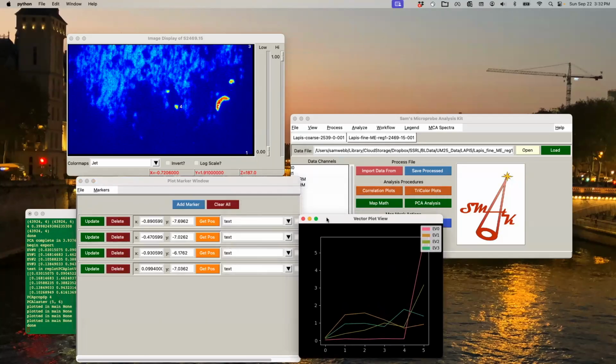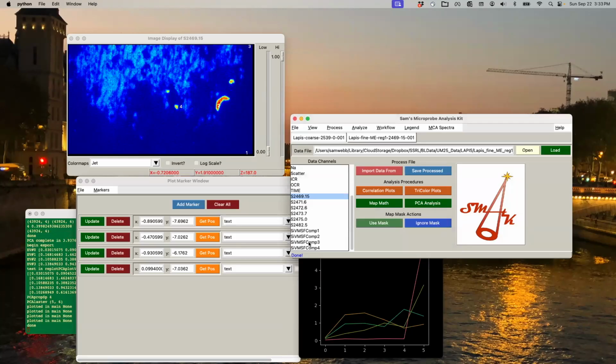And those are the spectra it picked up. But cool enough, it actually picked up a sulfate here, which is the first one here, and it picked up a pyrite and a lapis, it looks like. So, I mean, that's kind of what I was hoping it would do. Woohoo! Science. Yeah, actually looks pretty good. Actually, not surprised. Not too shabby, not even with that kind of crappy data.